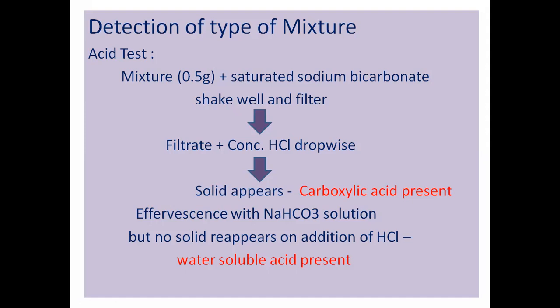So saturated sodium bicarbonate means, if you take water and add sodium bicarbonate, then after some time the saturation point comes, and if you further add sodium bicarbonate, it will not get dissolved in the water. It will remain as it is. So you have to add a little more until it does not dissolve. Normally you will be provided the saturated sodium bicarbonate, but you must know this. What is meant by saturated sodium bicarbonate solution?